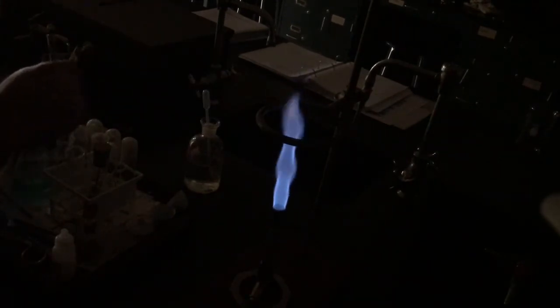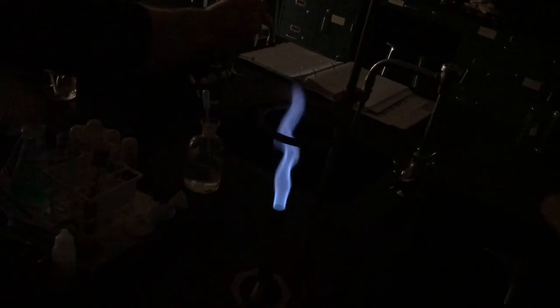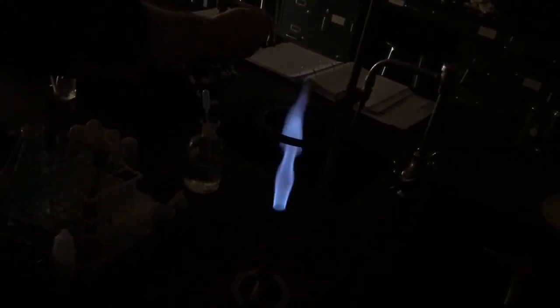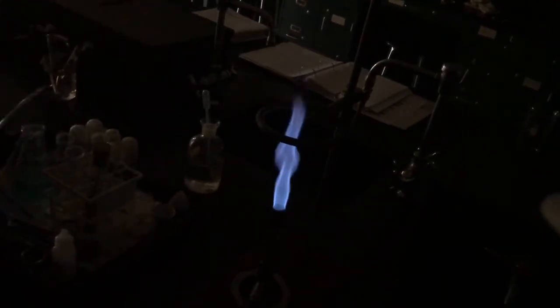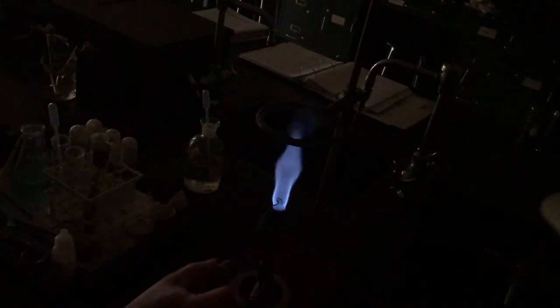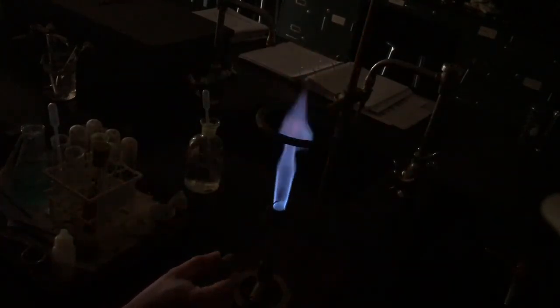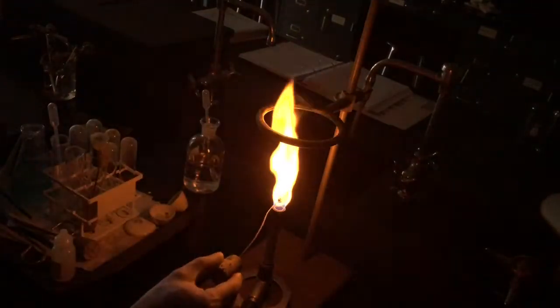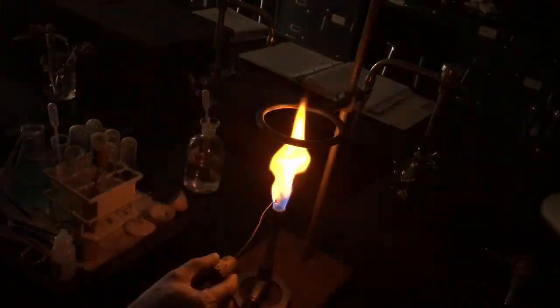If you're looking at fireworks, fireworks have different colors because they have different metals in them. So this is how they get them to burn at different colors. So the sodium flame test should look like this. It should be a bright orange. Okay, so if our unknown is positive for sodium, it's going to look like this.